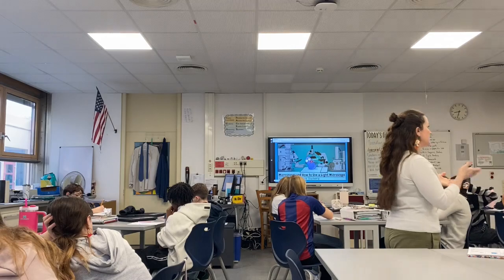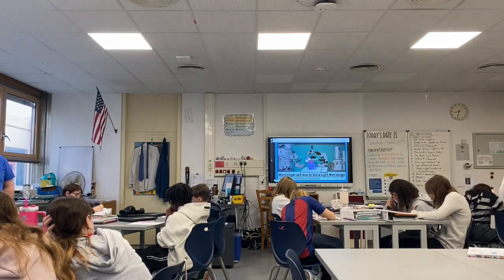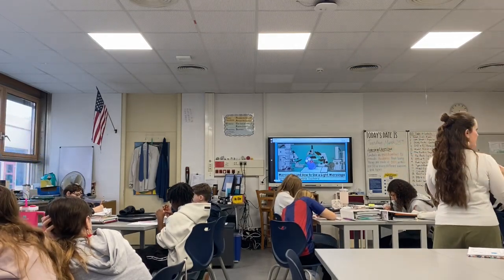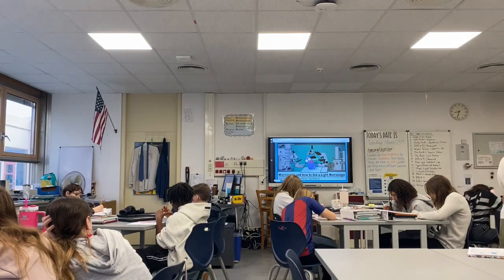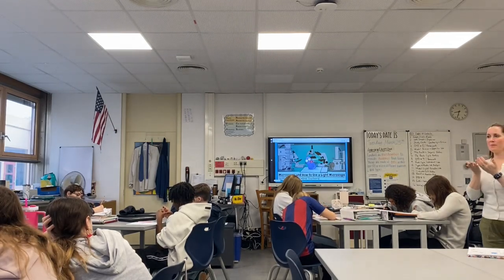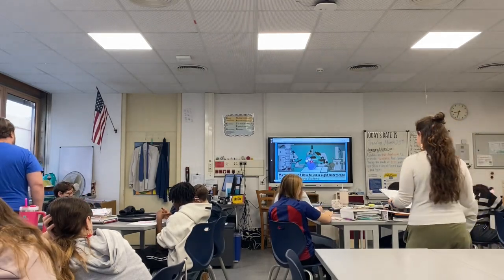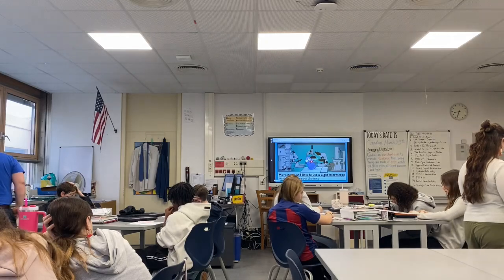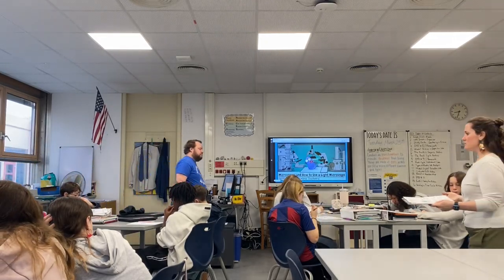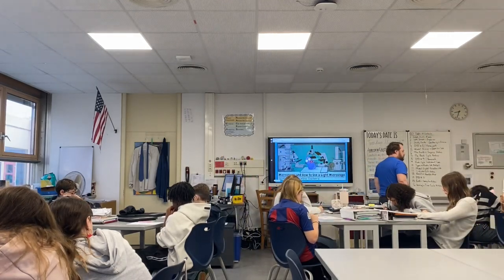So what we're going to see in our lab today is that once we get our sample focused, as soon as we go to the next magnification, it's blurry again. So we may have magnified it, but now we have to use resolution to bring it back into clarity, right? So magnification makes an image appear larger, and resolution allows you to see it clearly. Okay, so that should be what you have for number 1, are those two things.